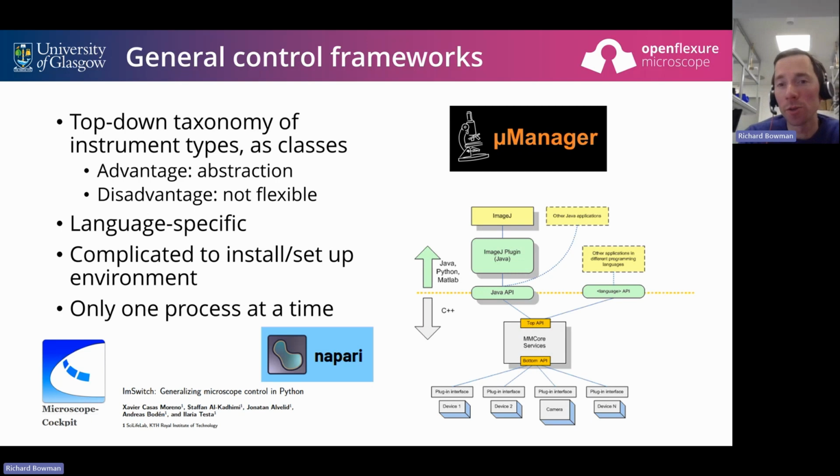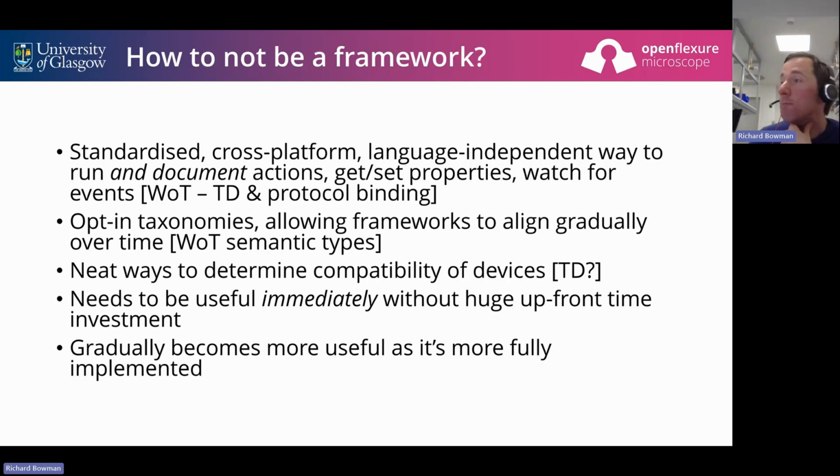Most of these frameworks also tie you into a particular language. They often have quite onerous setup of the programming environment, and generally they suffer from the one process at a time problem. So if I'm controlling my thing with Micromanager, I can't simultaneously control it with the manufacturer's GUI, which is a bit of a pain. I won't go into any more detail on that because I don't have time.